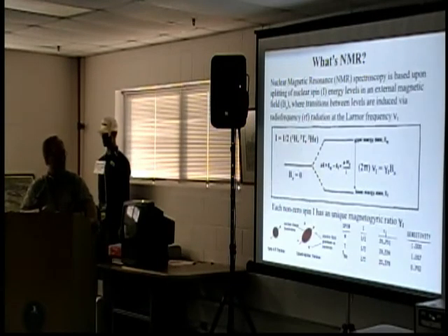Okay. Having given you now, in 10 minutes or less, what metal hydrides are, I want to tell you what NMR is. I mentioned we're not doing magnetic resonance imaging of a bed, but it is a spectroscopy based on the splitting of nuclear spin, I, the spin quantum number, into levels in an external magnetic field, where there are transitions between these levels at an RF frequency depending on the magnetic field. We're going to focus on spin quantum number 1/2, things like protons, tritium or helium-3.